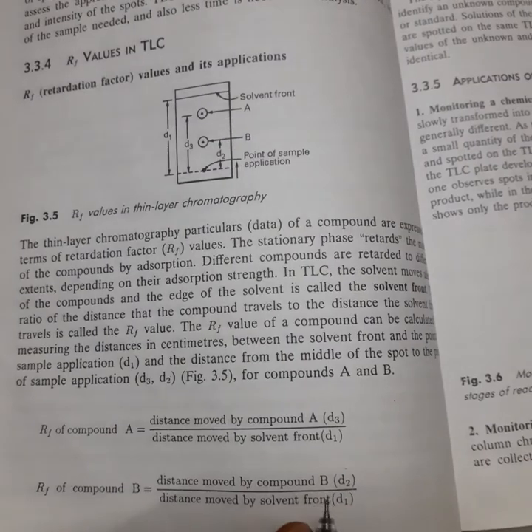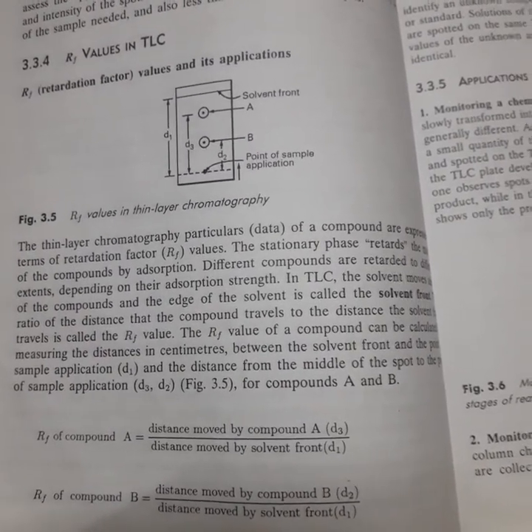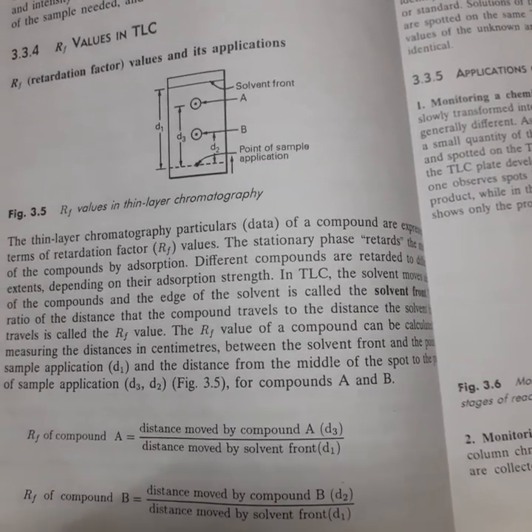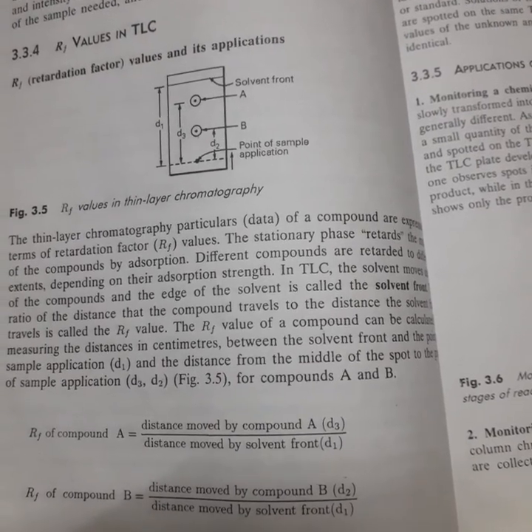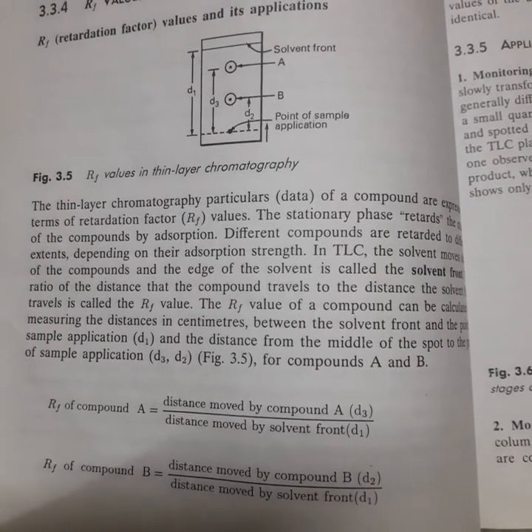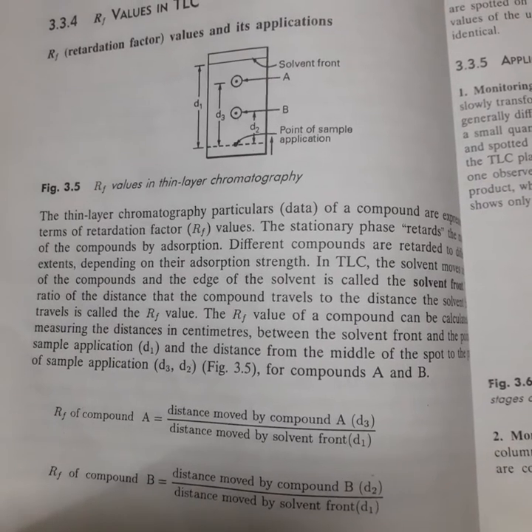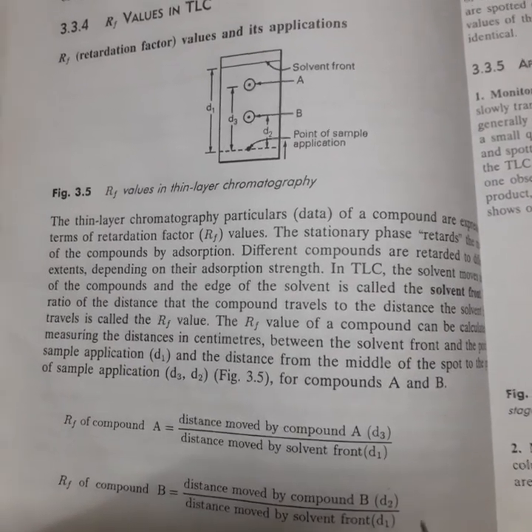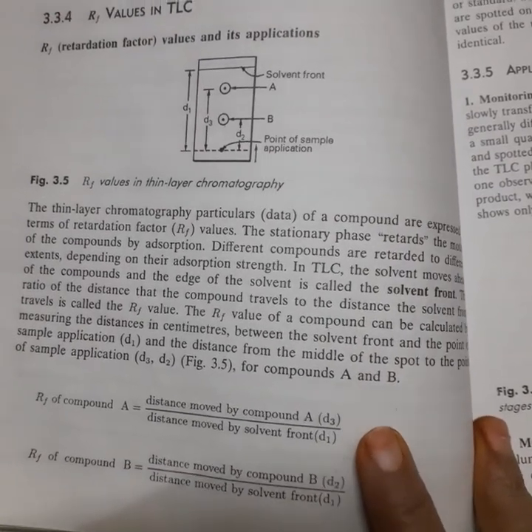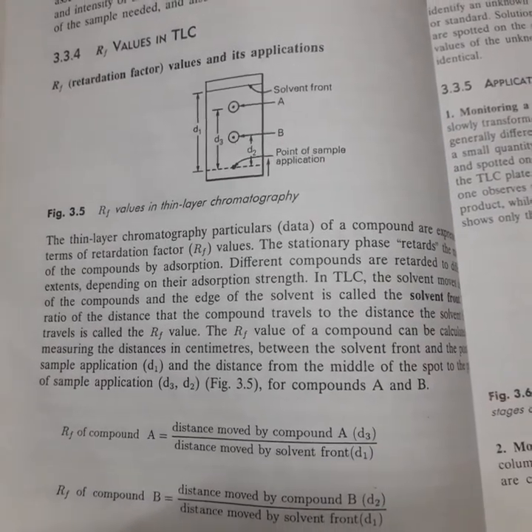Just like surface tension, density, viscosity, which are physical constants for each and every compound, and those are constant values. Suppose I did the experiment and someone else did that experiment in some other country, both of us should get the same result. Surface tension of water is the same, right? So similarly, RF values are also a physical property of the compounds. So already we have the RF values of different compounds.